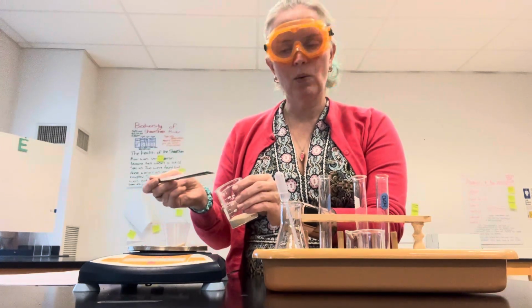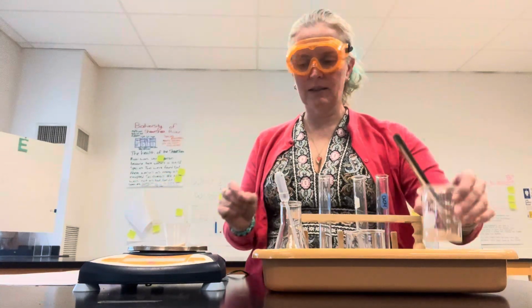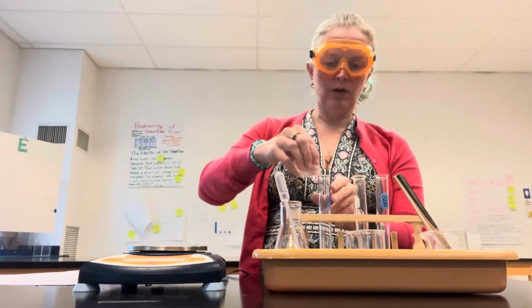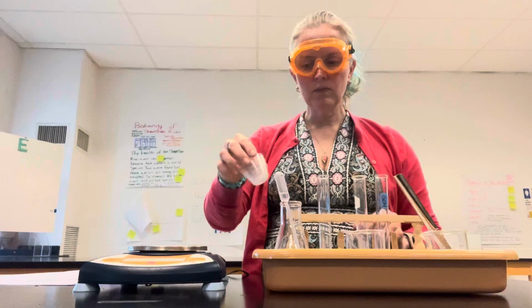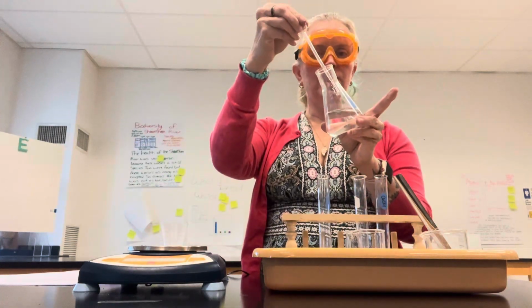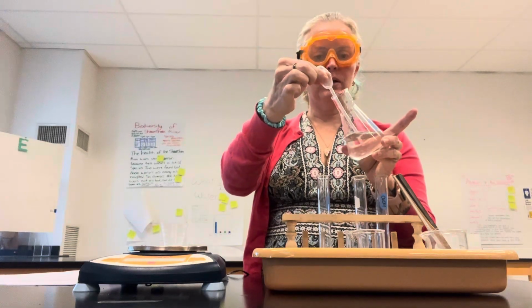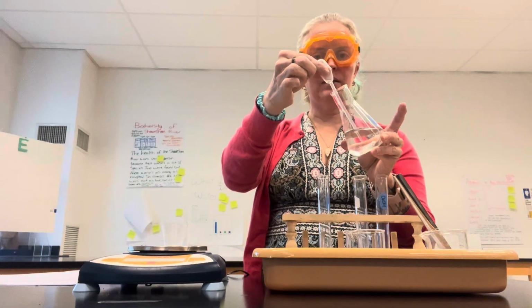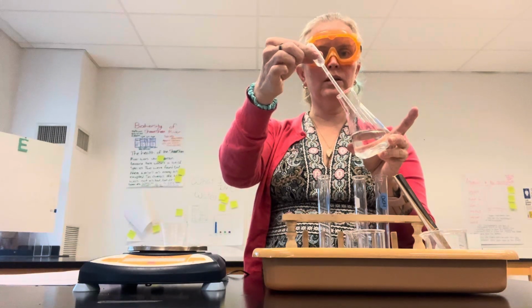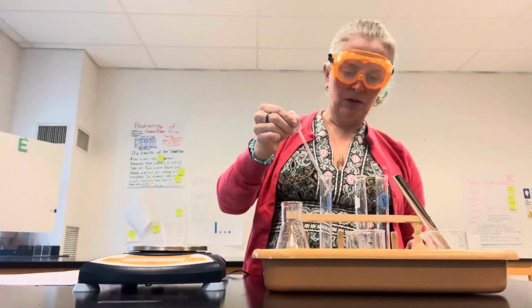It's okay if it's like 0.98 or 1.02. It doesn't have to be exact, but you can go for that if you like to. And then I would add the 1 gram of sand to my test tube. To add 1 milliliter of water, I'd use a pipette. And I'd want to first empty the pipette, and then you want to squeeze the bulb, put it under the liquid, and then let it fill up till it's just below the bulb. Once it's just below the bulb, take it out of the liquid, and then you can let go, and that should be 1 milliliter. And I'm gonna add 1 milliliter of water here.